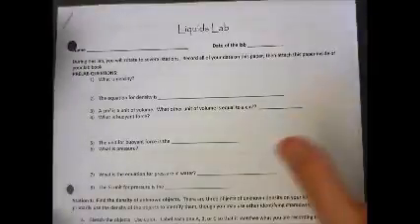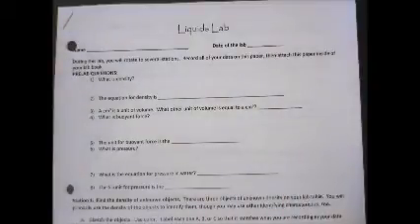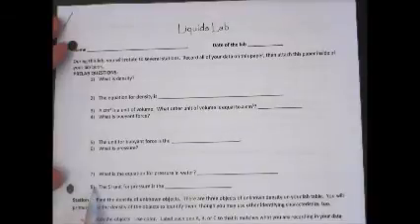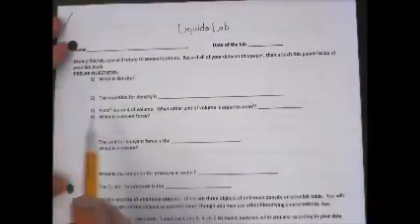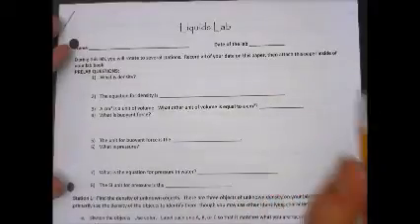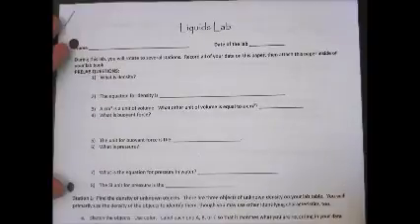We're going to show you the setup for the liquids lab. So here's the actual paper you should have got in class. If you didn't get it in class, it's going to be an attachment to this Plus Portals file. And all you need to do for the pre-lab is answer these 8 questions here in the pre-lab section, and just answer them right here on the paper. That's what I'm going to come around and look for. Do you have all 8 of those completed on Monday morning? And then I'll stamp it if you got it. If you don't get the stamp.